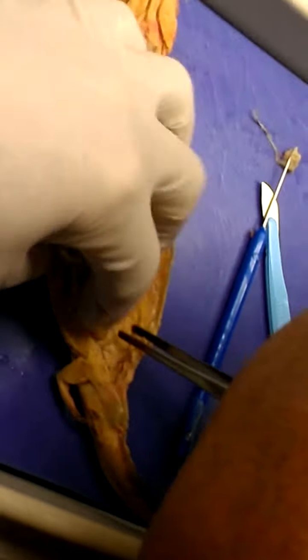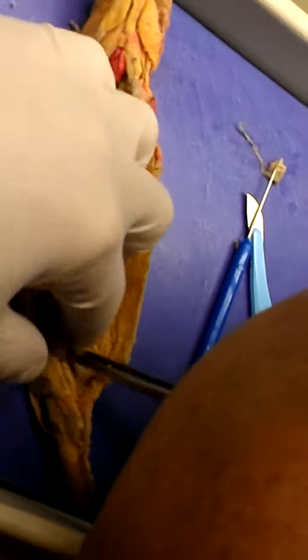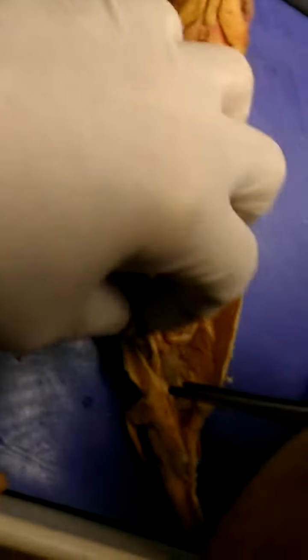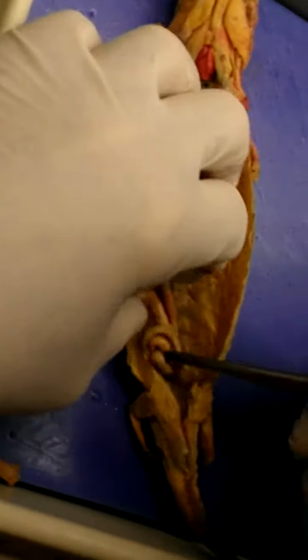If I pull the kidney to the side, what? No, I take that back. Wait a minute. Yeah. Oh, sorry. Yes, that is. Sorry. This is it. This is the kidney here. What I have here is called the mesorchium. Comes down into this structure here. These are all reproductive structures you're going to do next time.